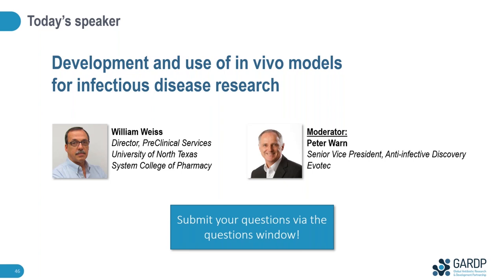related to that, and it's actually a very good question, people sometimes do quantitative cultures at the end of an experiment, which is either when some of the animals at that point are moribund or really have survived past the end of the acute period. So they may be in a recovery period. So I don't know if you've got any comments on using a sequential design or whether it's better to use a single time point or survival. This is obviously a big question. And also, I guess it's sort of hidden in this, what is the right time point? Should animals be euthanized for culture when they're moribund or when they're dead or at some point before it? So I don't know if you can summarize that just in a couple of minutes.